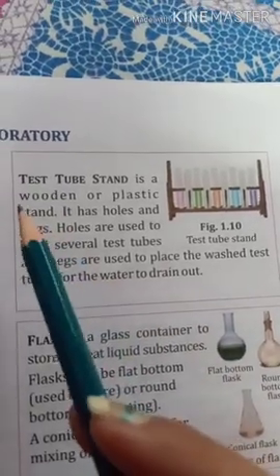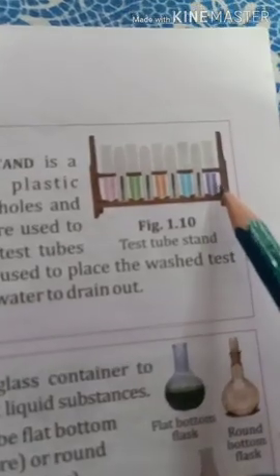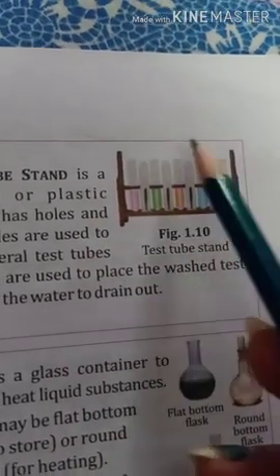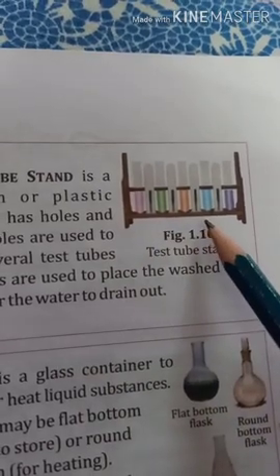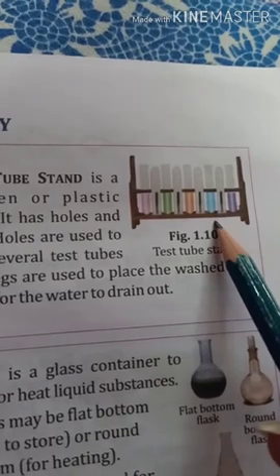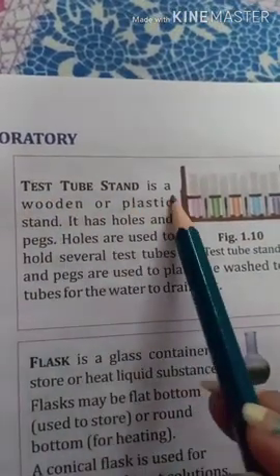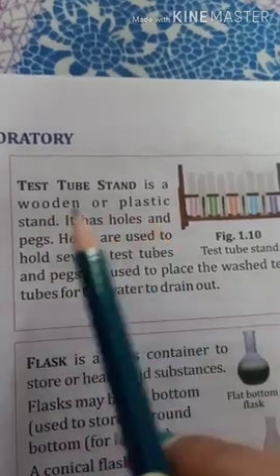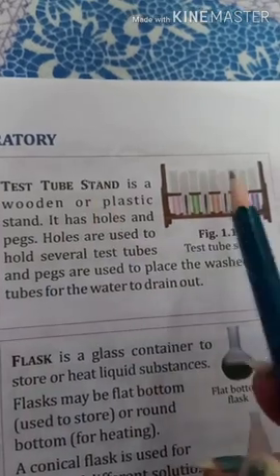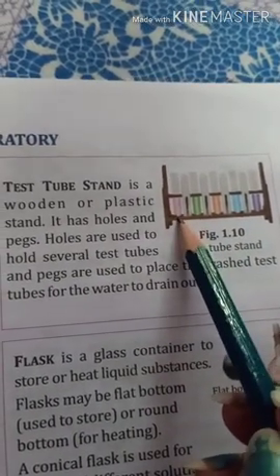Second apparatus is the test tube stand. This is a test tube stand, and the test tube stand is used to keep a number of test tubes together. This test tube stand is either made up of plastic or of wood. So, a test tube stand is a wooden or a plastic stand. It has holes and pegs. So, in this test tube stand, we have holes and pegs.